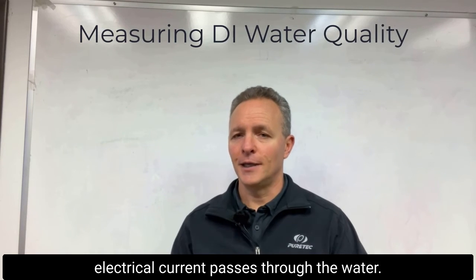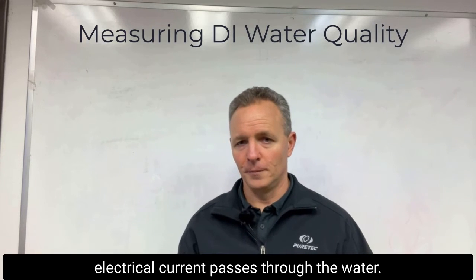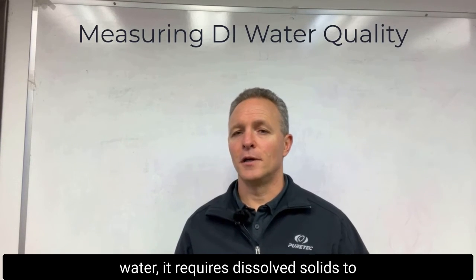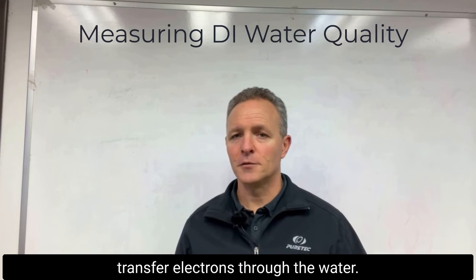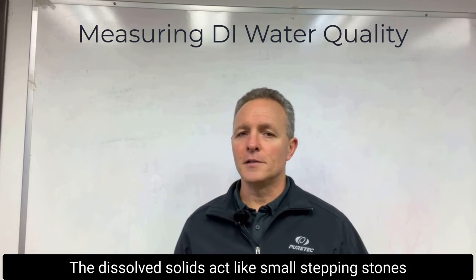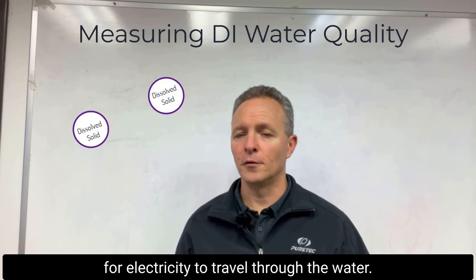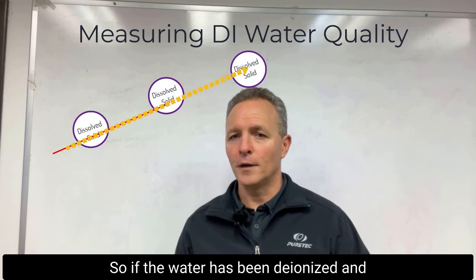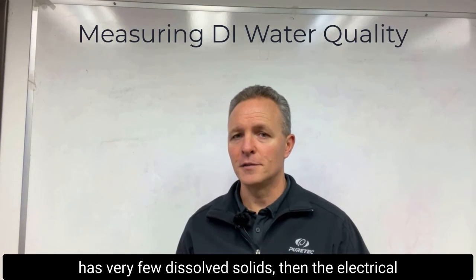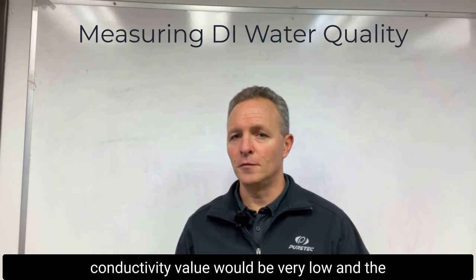That method involves measuring how an electrical current passes through the water. For electricity to pass through water it requires dissolved solids to transfer electrons — the dissolved solids act like small stepping stones for electricity to travel through the water. So if the water has been deionized and has very few dissolved solids, the electrical conductivity value would be very low.